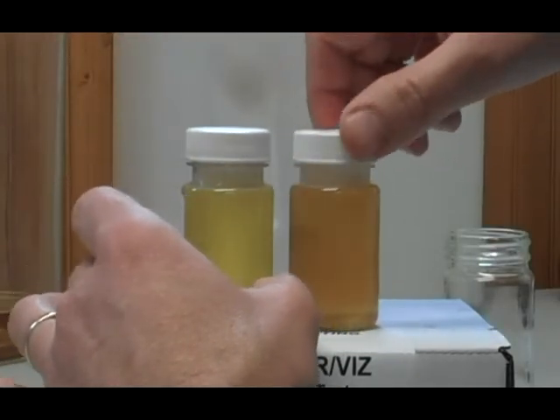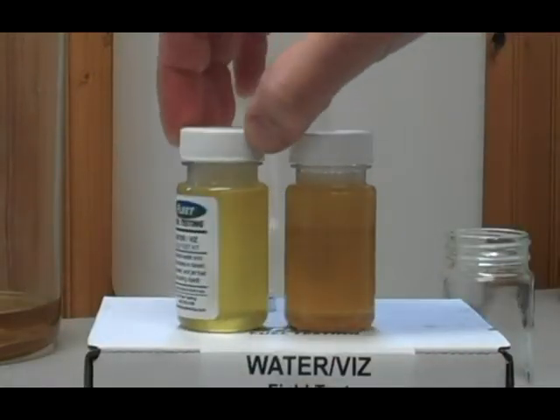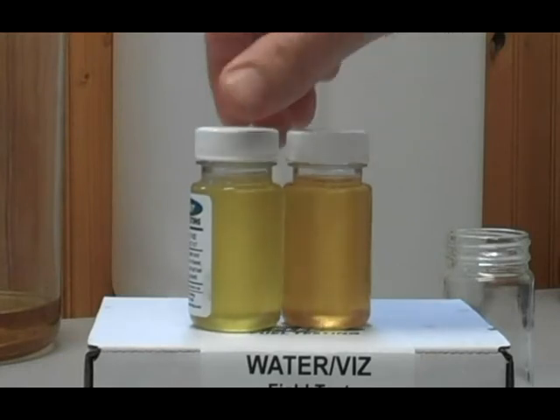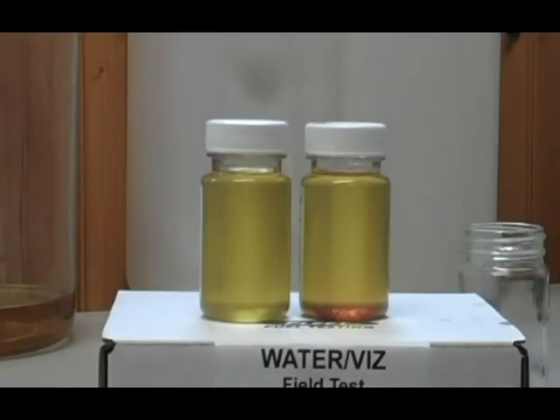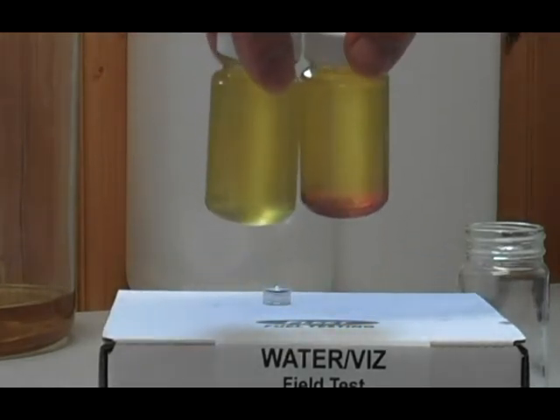We're going to look for a color change in the indicating solution — it turns to particles floating around. As these indicators pick up water, they start to turn red. You can see immediately in this sample that we added the drop — just a single drop of water — it is turning very red. You can see them start to settle out. Here are our samples after three or four minutes. You can clearly see the red ring at the bottom of the sample where the water was added. Hold it up so you can see it there.